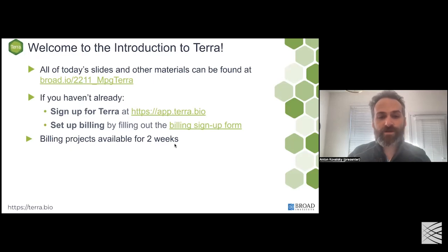And then if you want to follow along with today's hands-on session, you'll also need to be added to a billing project. We have a billing project that we've set up just for today's attendees. In order to get added to that, you should go to our billing sign-up form. I believe that we're sharing that link in the chat. If you just add your email to that sign-up form, make sure that you add the email that you used to register for Terra, because those emails have to match. If you do, then you'll be able to play around on our billing project for the next 2 weeks.